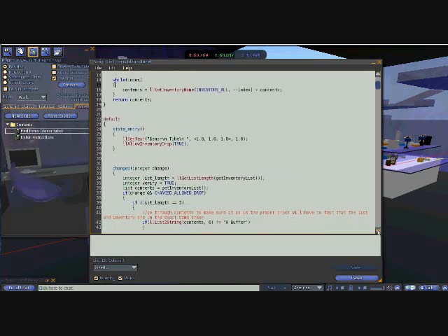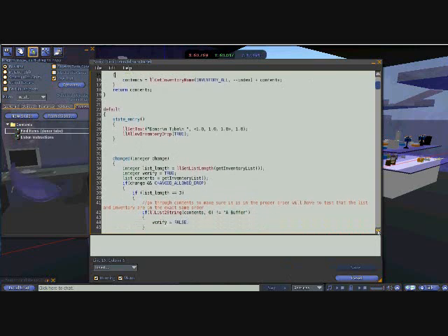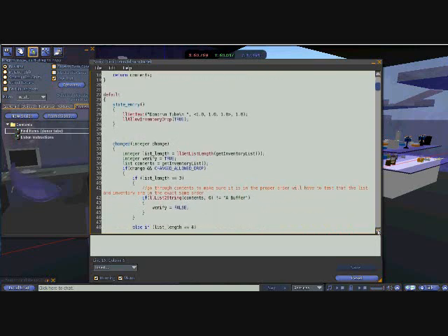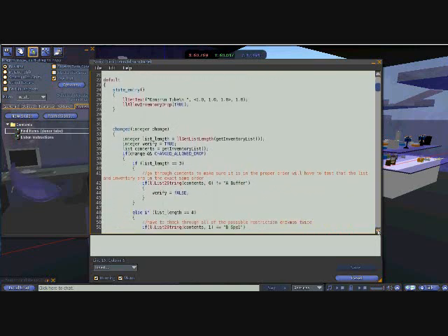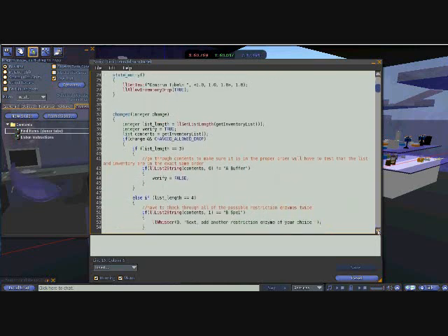As of now, I have checked the order within the inventory so everything has to be alphabetical, which is something I may consider changing in the future.